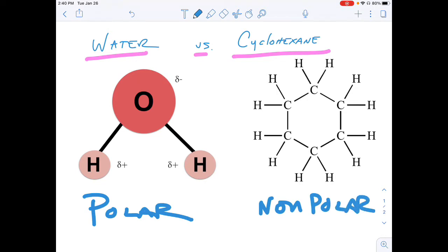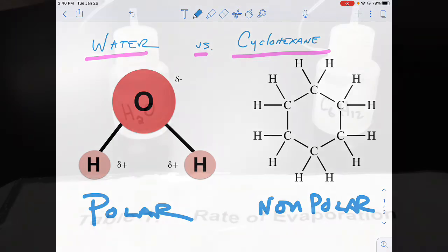From that information, we're going to look at 7 different examples of how these molecules interact with themselves. And then at the end, we'll do a little bit of a review and see what kind of similarities or differences we see throughout the experiments.